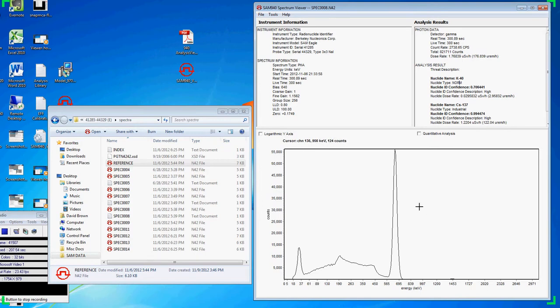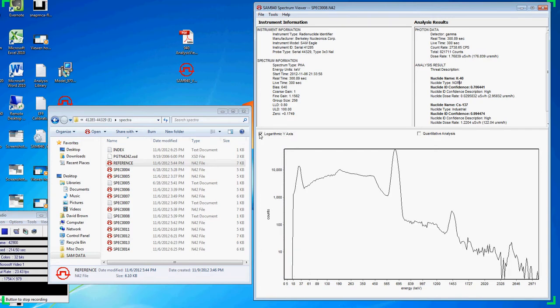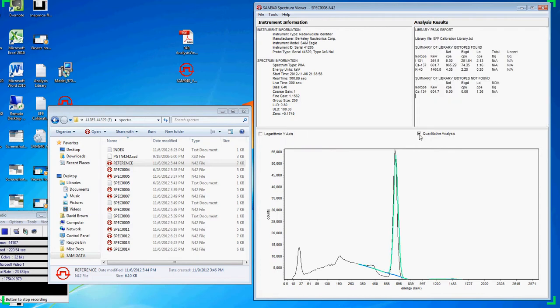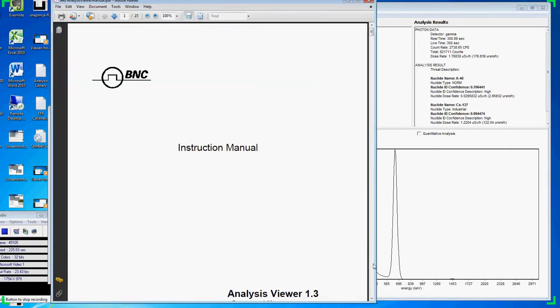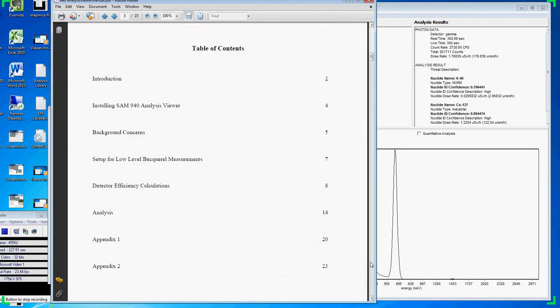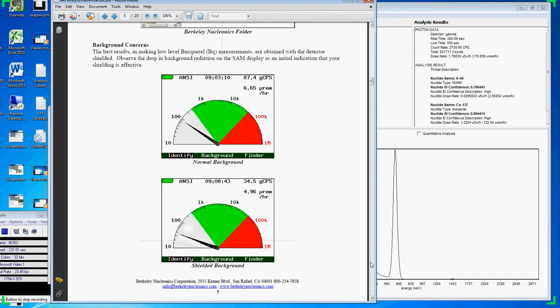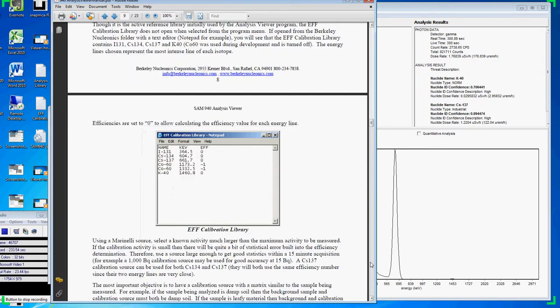For additional details on more advanced features such as our logarithmic analysis or quantitative analysis with Becquerel conversions, be sure to see the user manual and also our videos online titled Using Viewer 1.3 Advanced Features.